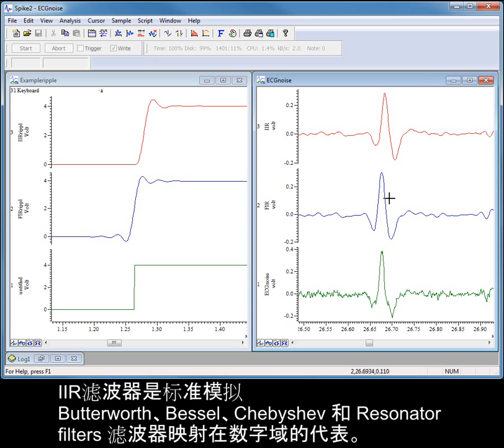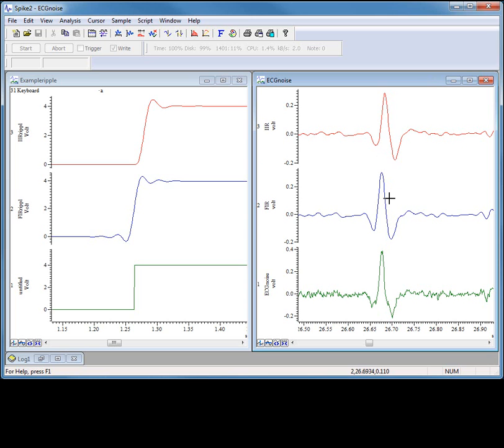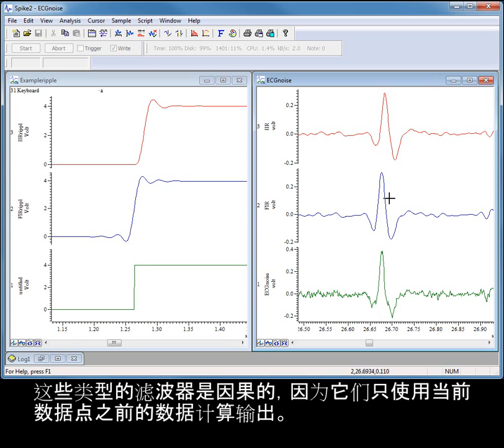IIR filters are representations of standard analogue Butterworth, Bessel, Chebyshev and resonator filters mapped into digital form. These types of filter are causal, they only use data before the current point to calculate the output.